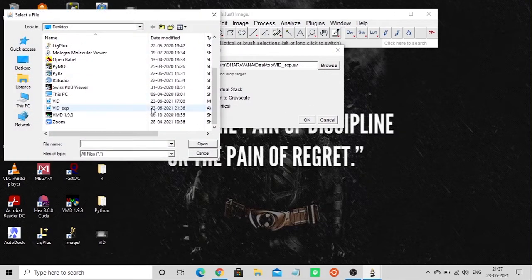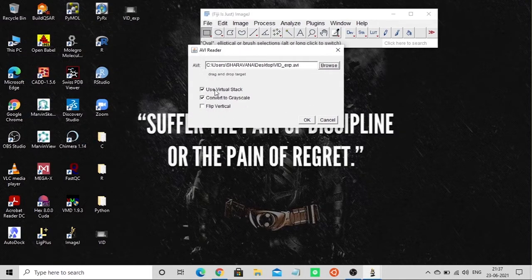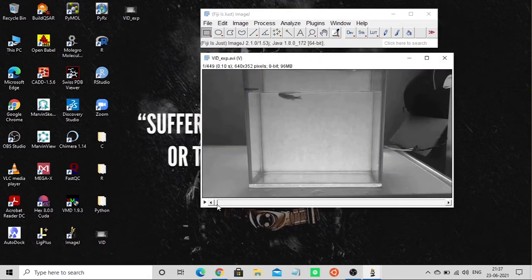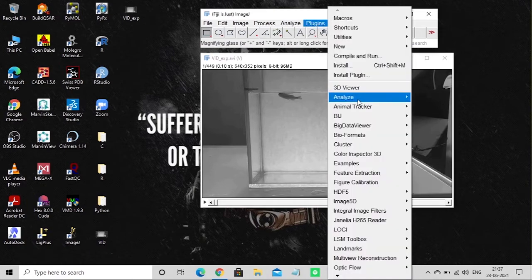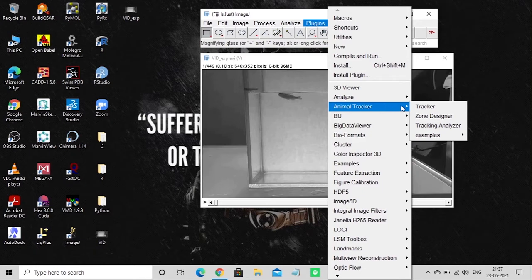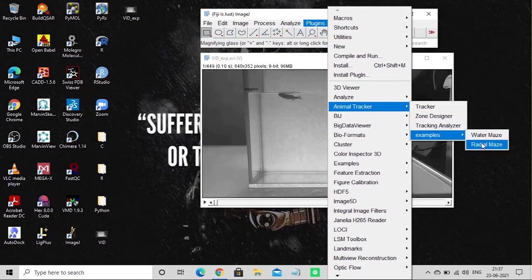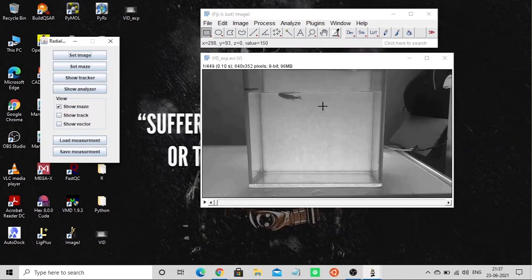To import, click Import then AVI, choose the file, check 'Use virtual stack' and 'Convert to grayscale.' The file loads. Now go to Plugins — the Animal Tracker plugin will look like this after installation. These are the tools available for tracking. There are also two template forms available for easy external analysis.